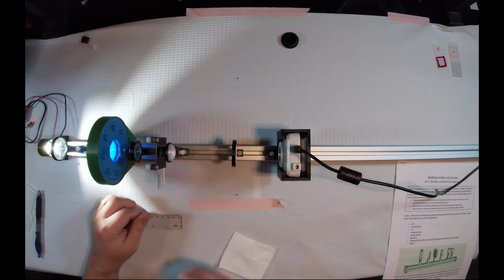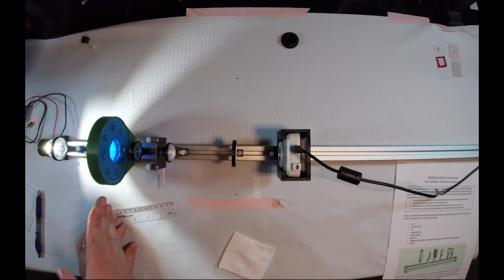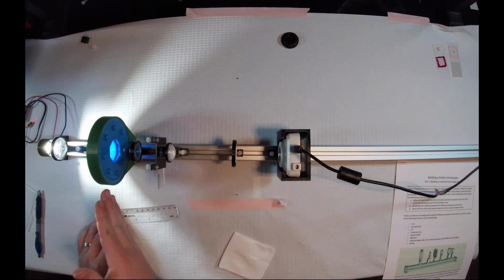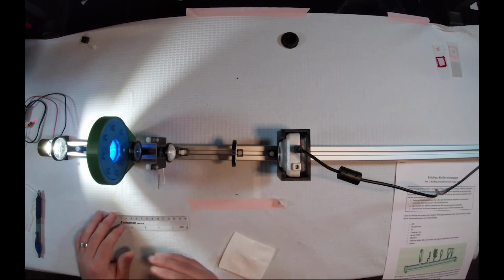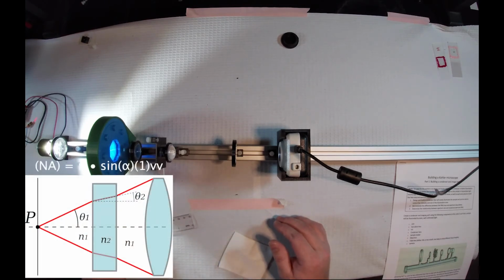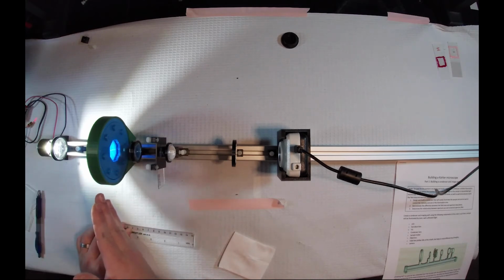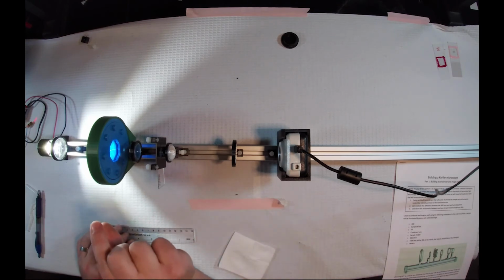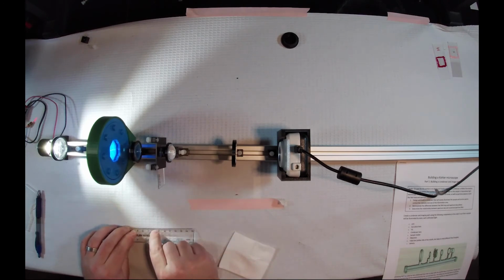So if we know that the minimum diameter of illumination light that we're letting through at this back focal plane is 1 millimeter, and that is mounted a focal length away from our condenser, then using the formula for numerical aperture and a little bit of trigonometry, you should be able to draw some triangles and figure out exactly what is the radius of light that is entering our condenser lens, and then how far away from that condenser lens is it being focused to, right?